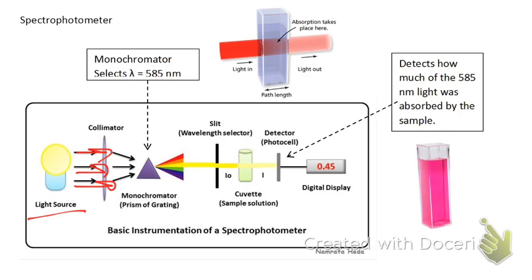special instrument in the spectrophotometer that is basically a prism that's going to take the light from the light source and break it into its continuous visible spectrum. And then the monochromator is going to select a specific wavelength that we have determined prior to doing the experiment, and only use that light throughout the experiment.